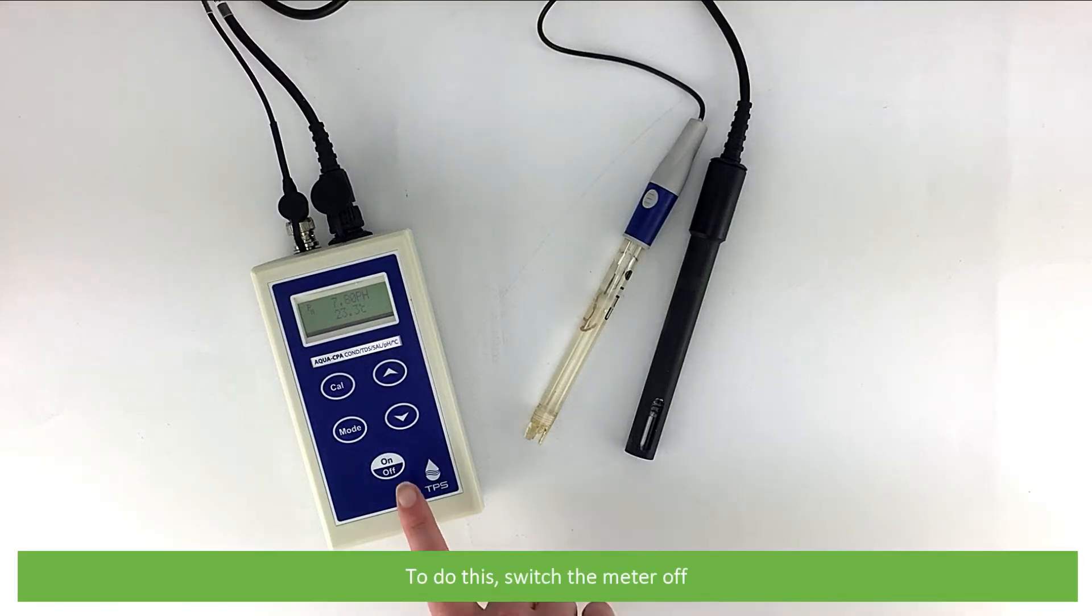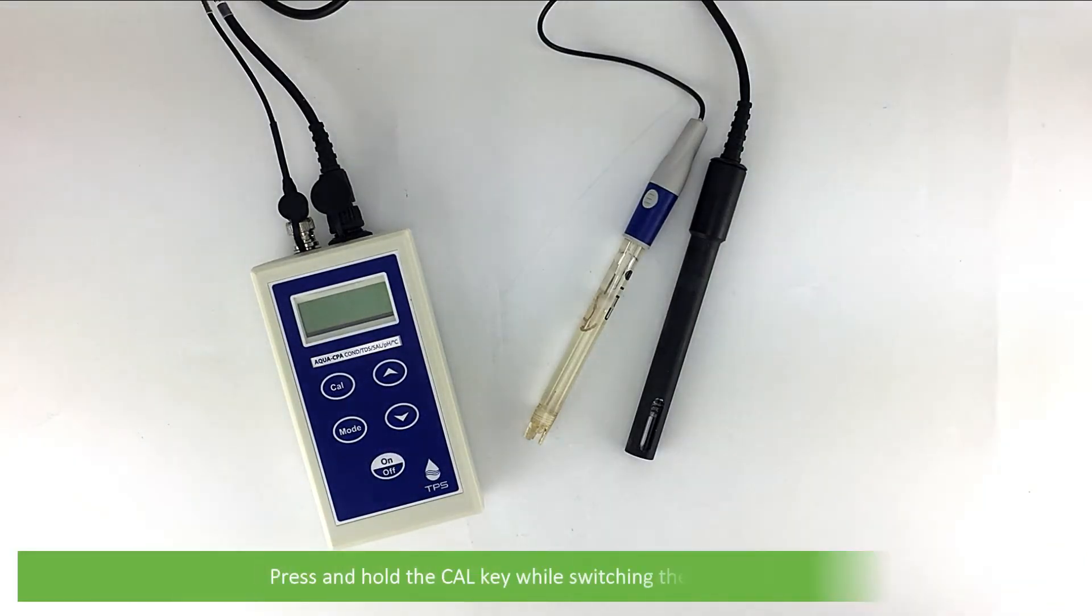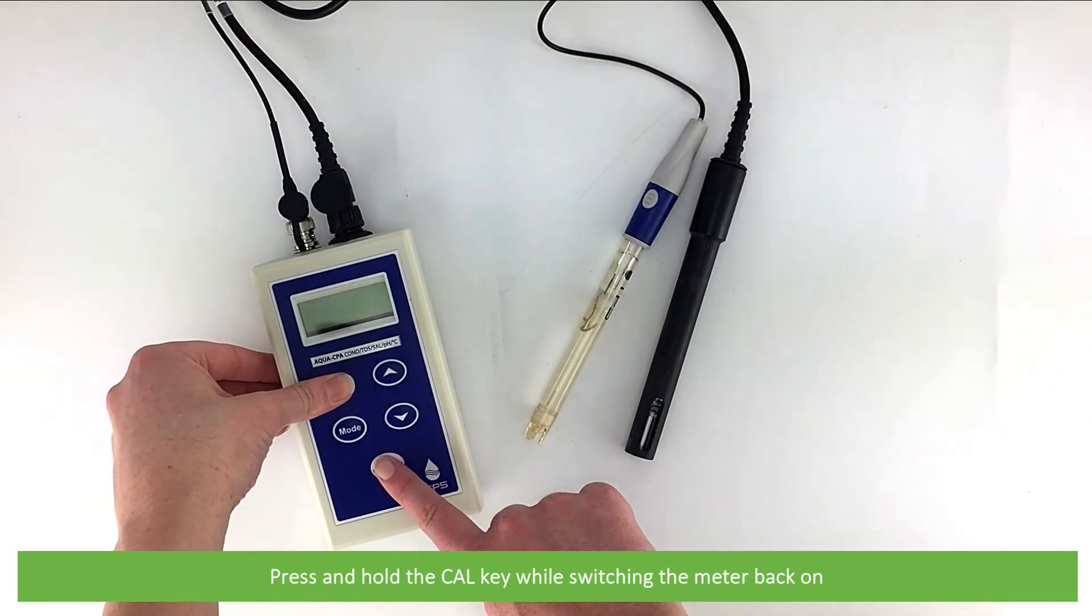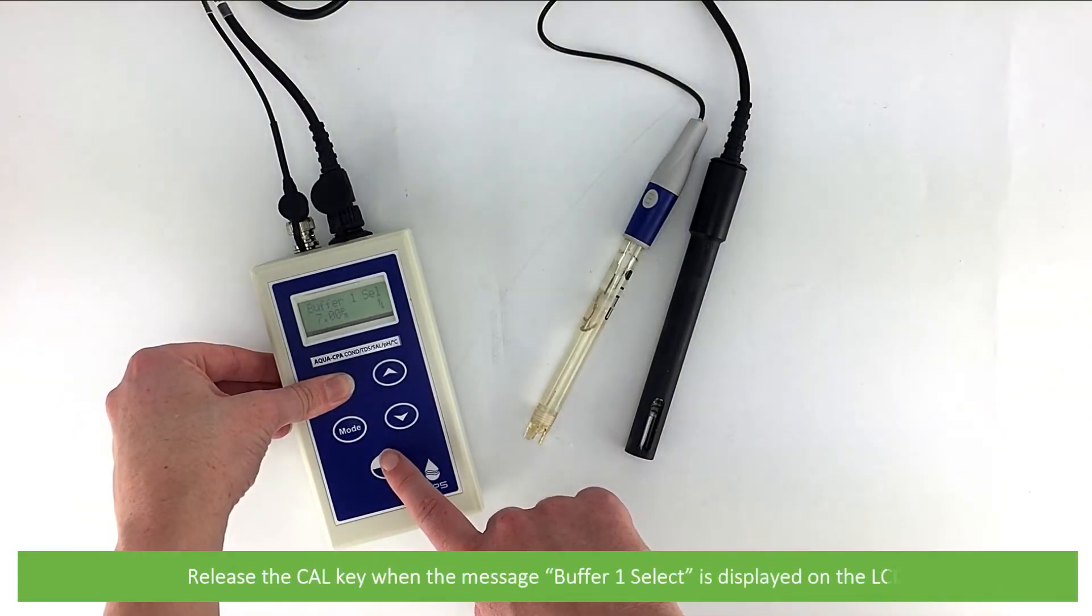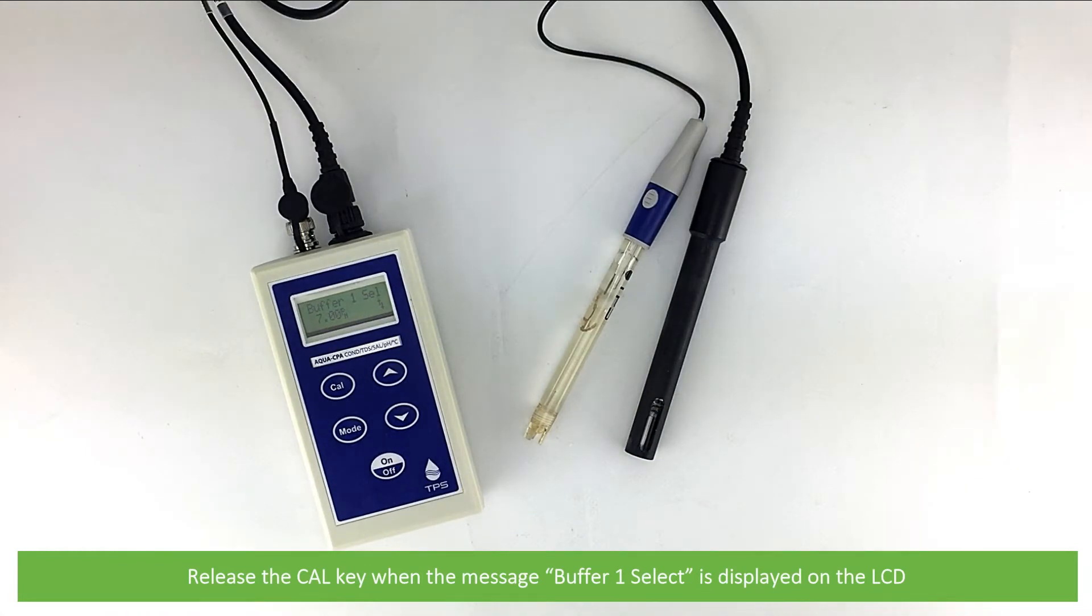To do this, switch the meter off. Press and hold the CAL key while switching the meter back on. Release the CAL key when the message buffer 1 select is displayed on the LCD.